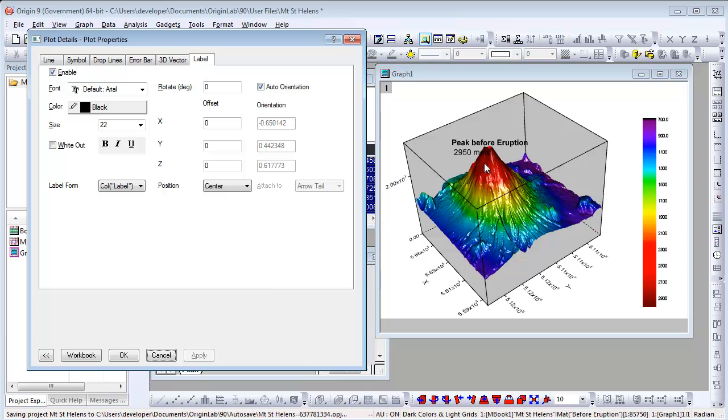By default, the label is added to the center of the point. We can set the Z offset to move the label location a little.